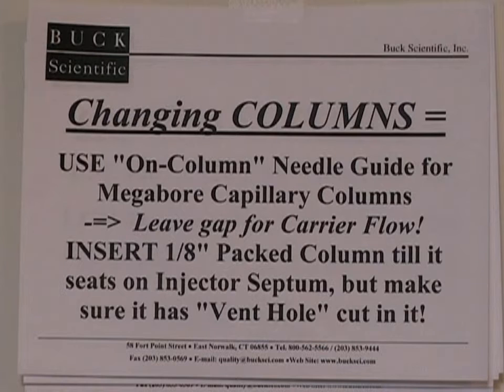Likewise, for a 1/8 inch pack column, make sure that there is a vent hole to allow the carrier gas to go through, or when you seat it up against the septum, you will not get any flow through the column. Check these if you ever have difficulties getting peaks off the system.